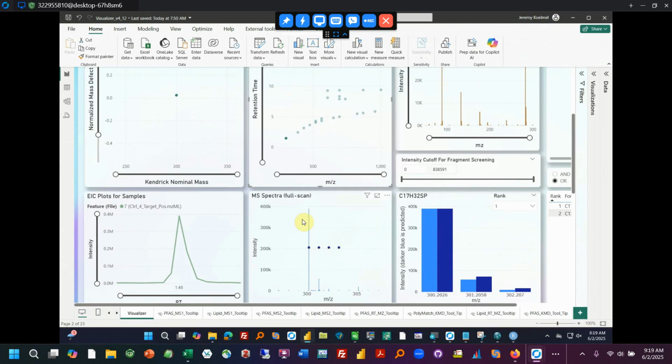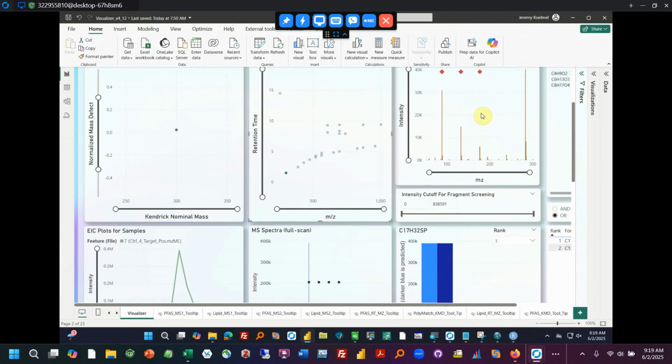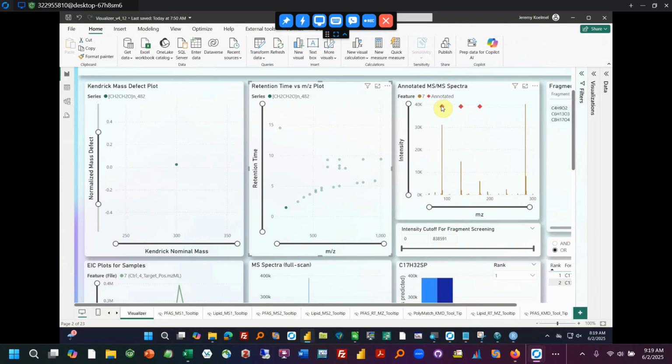The MS1 isotopic profile is going to be more useful. These are extras. Just using the MS and these trend lines alone, you can be pretty confident in these series, or highly confident, especially when you're getting all these pegylated fragments, which we can scroll over to show.